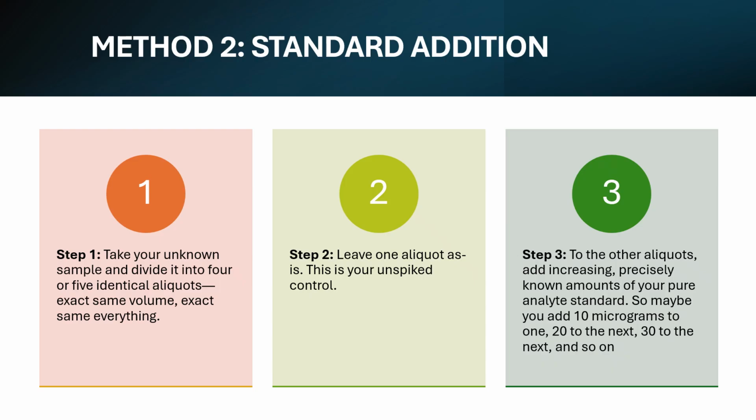You've just determined the analyte concentration without ever needing a blank matrix. Beautiful, right?